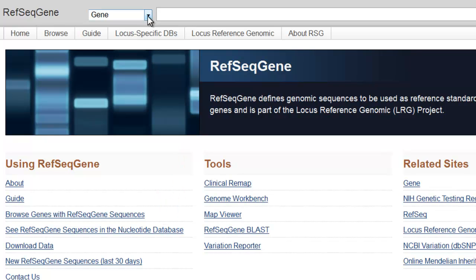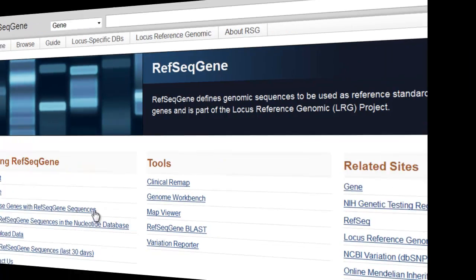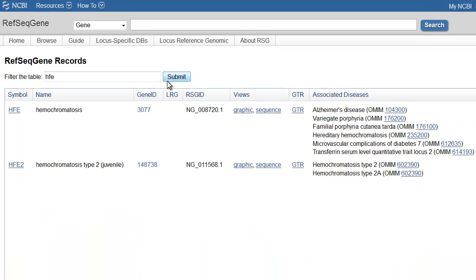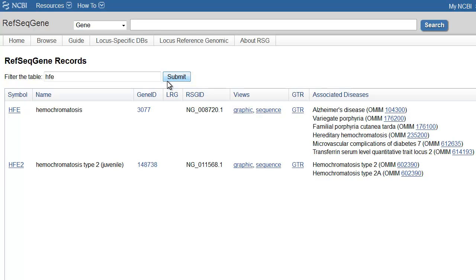Let's start our first task, finding a RefSeqGene sequence, by using the Browse tool. You can enter any part of a word in the Filter the Table box. For example, I'll type HFE and click Submit. In the row for the hemochromatosis gene, we see links to Gene, Sequence Records, GTR, and OMIM. Be aware that you may get more results than you expect, because the letters you enter may occur together in multiple contexts. One way to display the sequence of the HFE RefSeqGene record is to click on Graphics in the Views column.